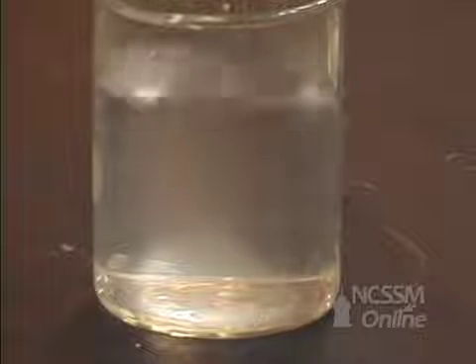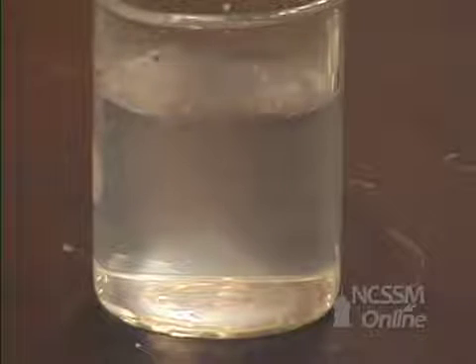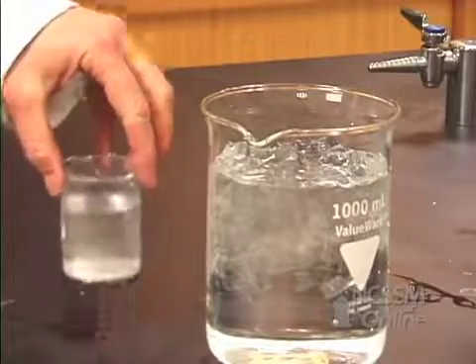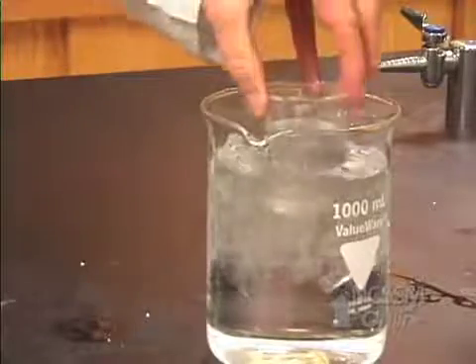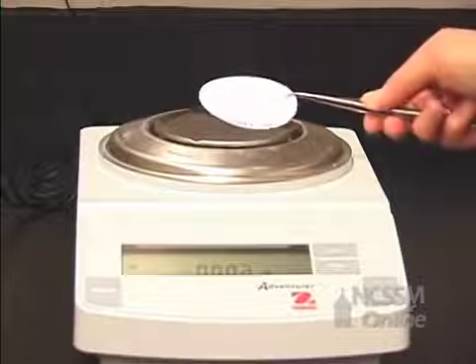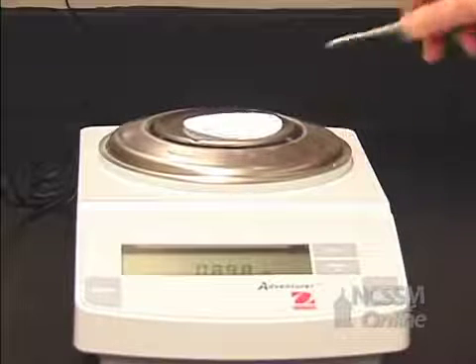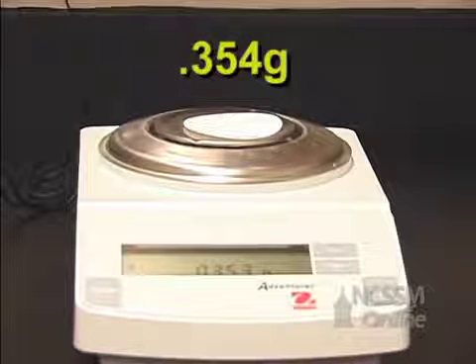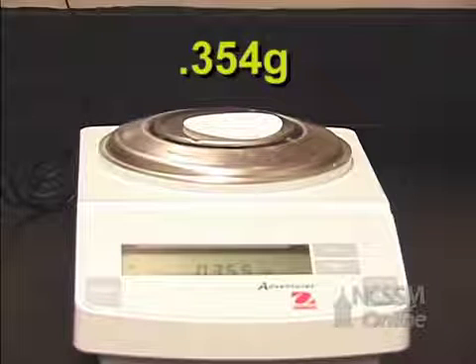And now we get to wait again. We need to give this time for the crystals to form. So we're going to put it back in our ice water mix. We're going to weigh a filter paper. All right, the filter paper weighs 0.354 grams. So make sure you record that number.